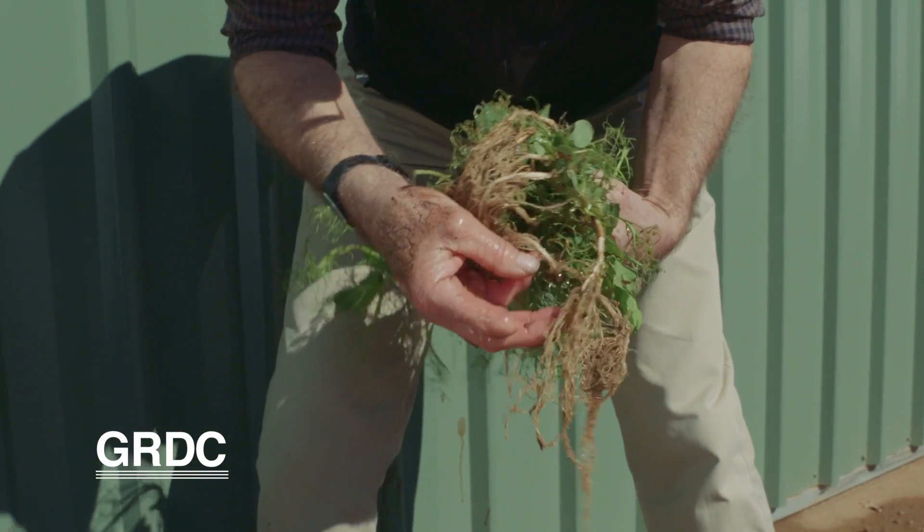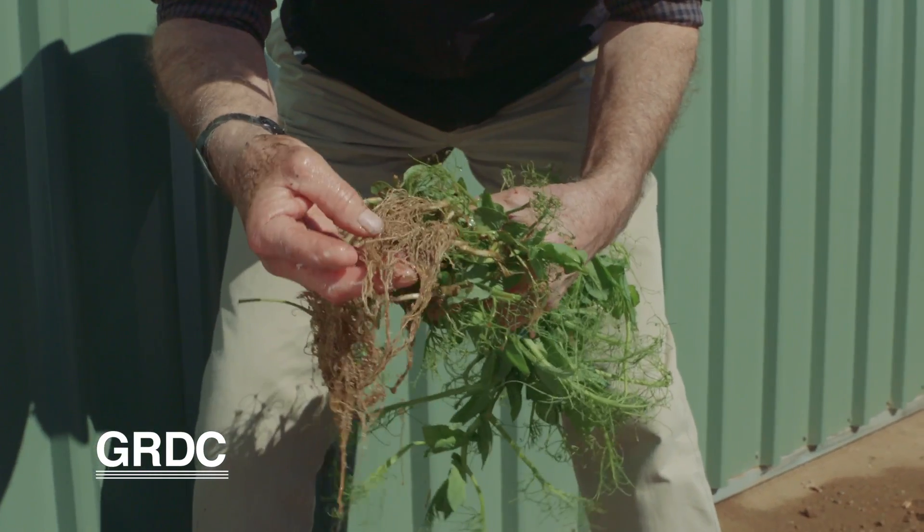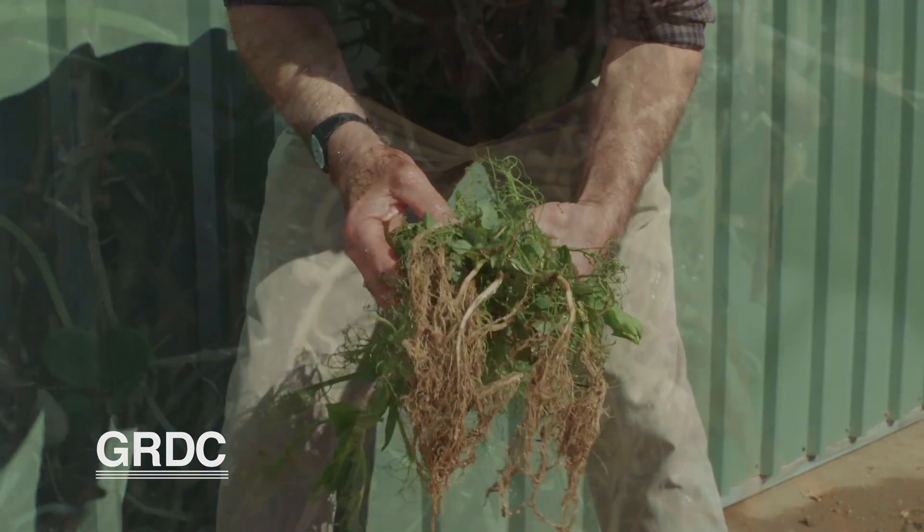We've got an earthworm here too — that's really good. We'll take them over to the ute and we'll have a look.